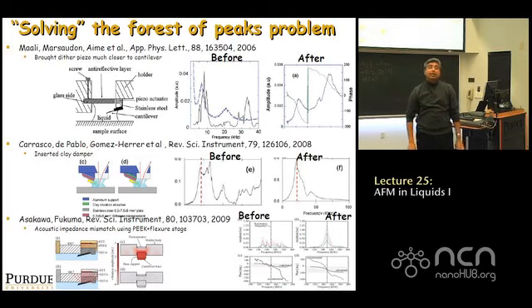That's also good, but there you're supplying some current, and there are problems with supplying current in electrolytic solutions. As long as you don't apply too much current, you don't get electrochemistry, but you have to do it so that the currents you supply are small enough. But if you're trying to drive with large amplitudes, the Lorentz force actuation is not good because you're applying large voltages and you can get electrochemistry.